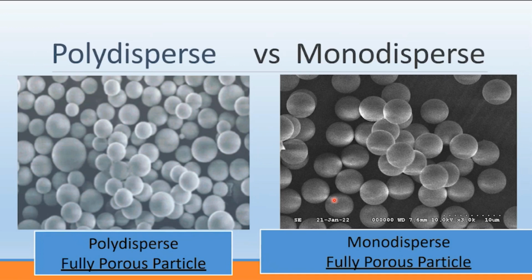So a brief background, we are very familiar with the columns that are on the market, which are polydisperse. You may or may not be aware of that, but they have particle dimensions that range across the desired average. So if you're at 2 microns, you're going to have particle dimensions that vary plus or minus a certain percentage based on how those are manufactured.